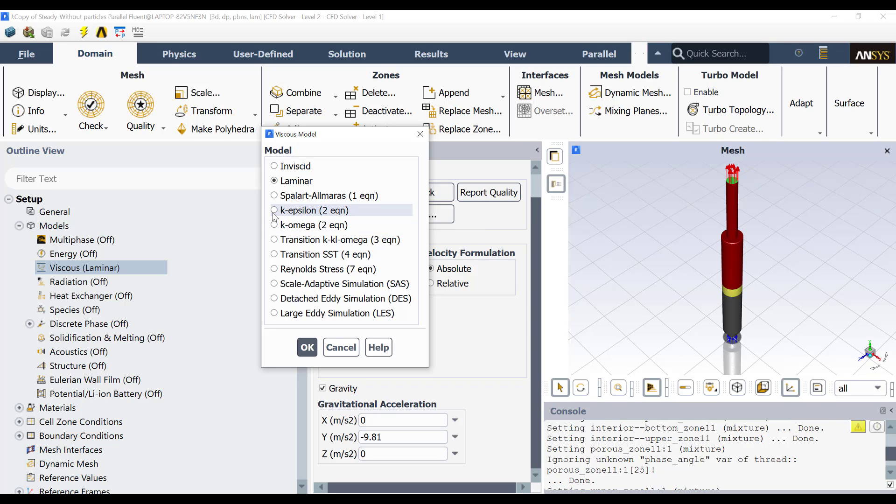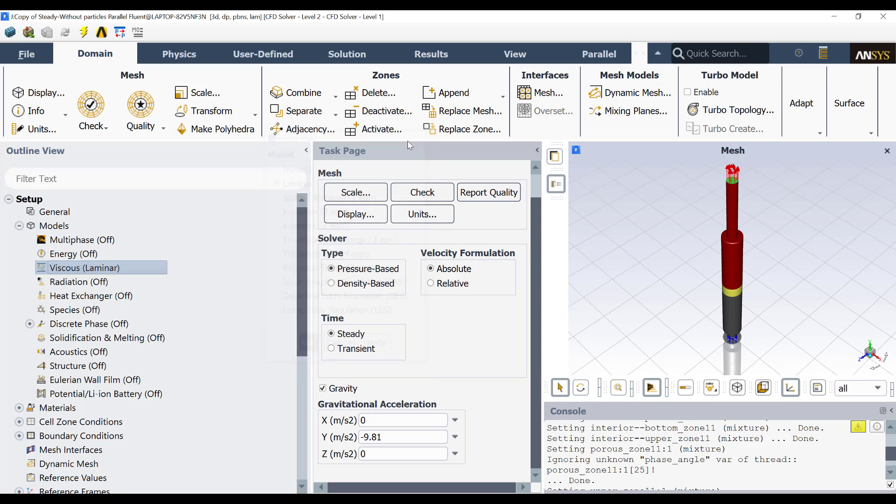These are the most robust turbulence models in ANSYS Fluent. These are RANS turbulence models, then they are not too much time consuming. Then we don't have any other model enabled.